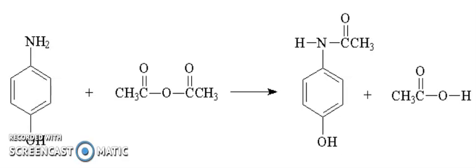Then what you need to do: warm the filtered para-aminophenol hydrochloride solution on a steam bath, you know the steam bath, and add the buffer solution in one portion with swirling. Immediately add 2 ml of acetic anhydride while continuing to swirl the solution. Continue heating on the steam bath while swirling vigorously for 10 minutes. Then what you need to do: cool the solution.